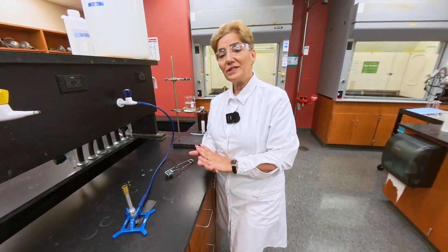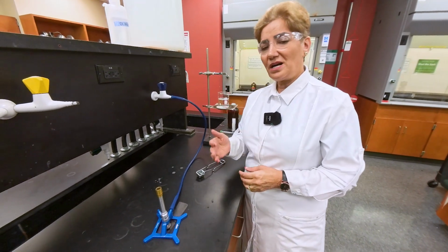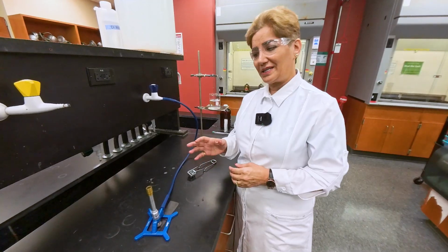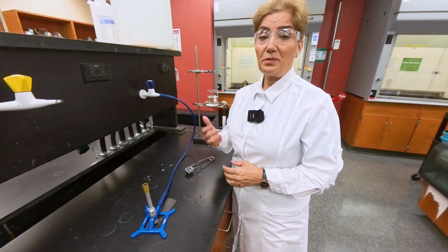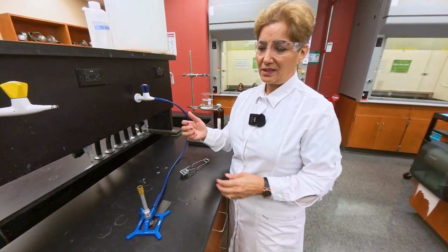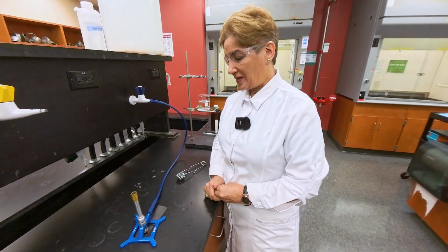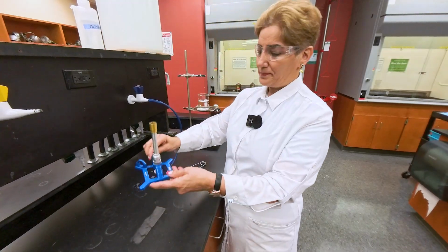Now, if you don't give enough oxygen, instead of carbon dioxide we will have carbon monoxide production. When carbon monoxide is produced, the flame is not a hot flame. Carbon monoxide is a toxic gas. It's going to cause smoke, and it can contaminate the equipment and glassware that you're trying to heat up. So how do you get a good flame?